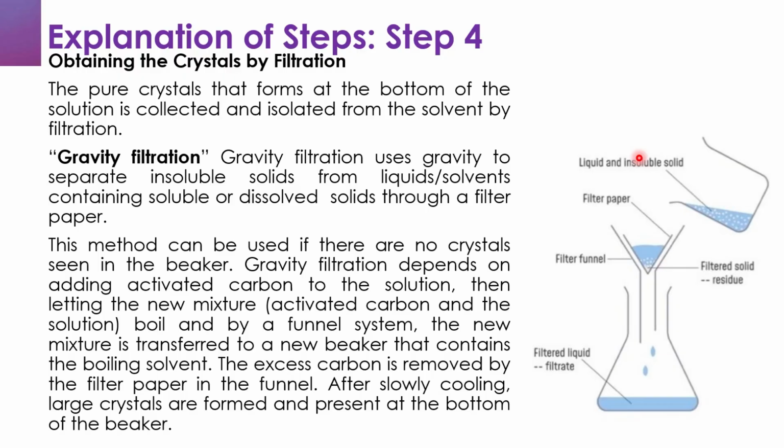So now let us look at the second type of filtration, and this has to do with the gravity filtration, and this is also a setup for the gravity filtration. So this is our filtered liquid, and this is our funnel, and this is our filter paper over here, and these are the liquids and the insoluble solids seen over here.